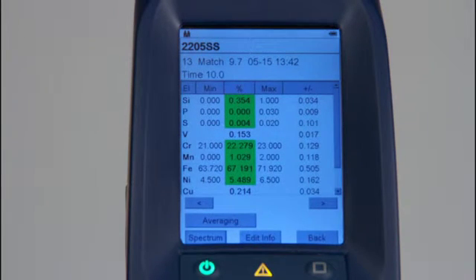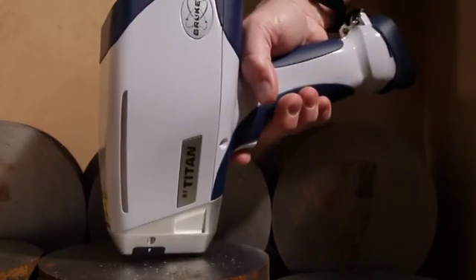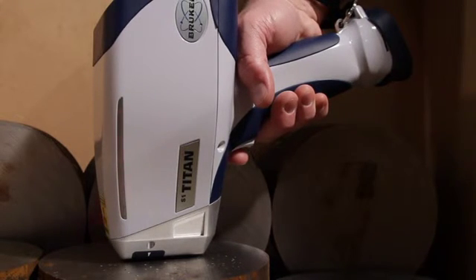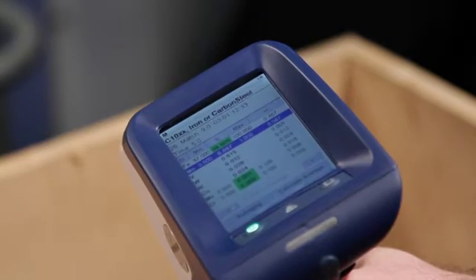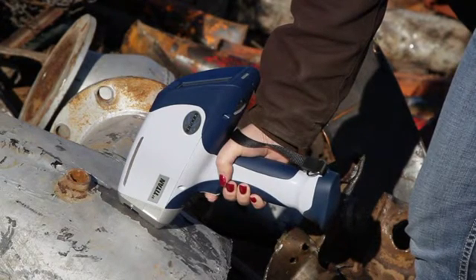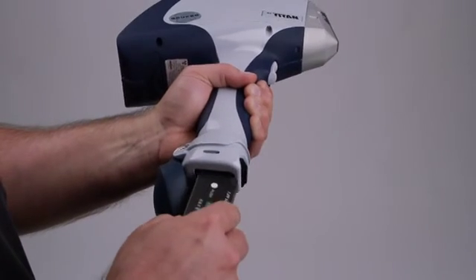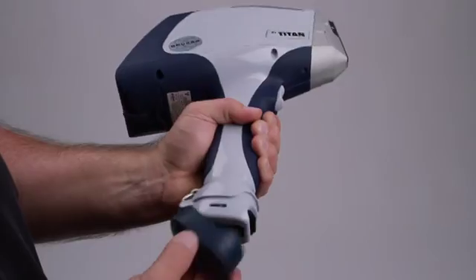Once the sample is prepared and the interlocks are satisfied, the final factor in starting the measurement is the state of the analyzer software. There are two states where the analyzer can start an analysis: at the conclusion of the previous measurement, or at the ready-to-test screen. If all of the conditions are met, then pulling the trigger on the instrument will start the measurement. This will be indicated by the red X-ray lights coming on and the data appearing on the screen. If for any reason the red light goes off, the measurement will stop and no additional data will be taken. Note that one cause of premature termination of the measurement is that the battery has become discharged. The on-screen warning will indicate the battery charge is low. If the measurement ends prematurely, one of the first actions to take would be to replace the handle battery with a fully charged one.